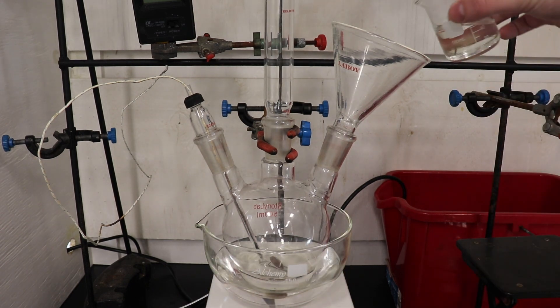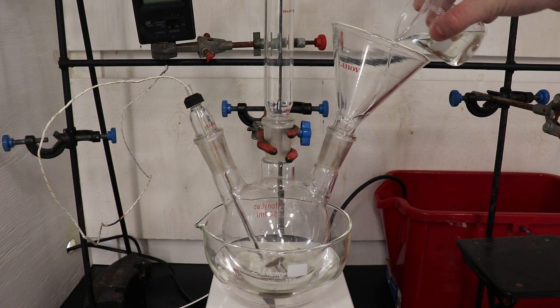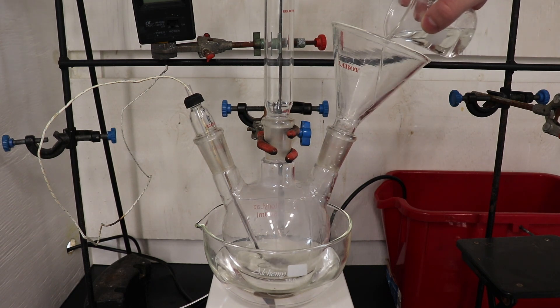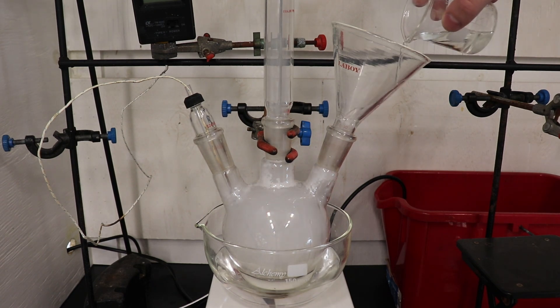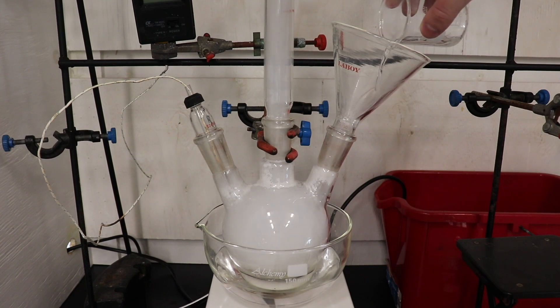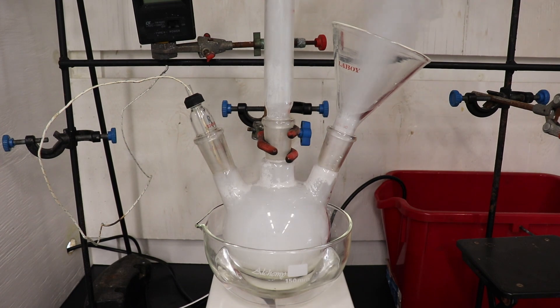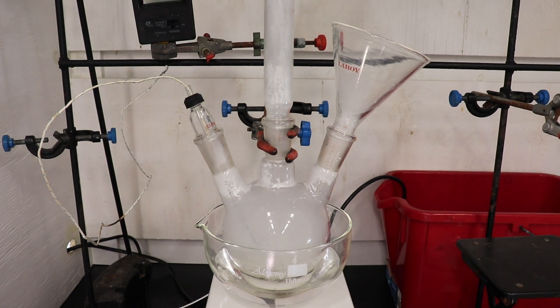Hydrochloric acid was then added until the mixture was strongly acidic, which took about 50-60ml of 31% HCl. The addition of the acid was very strongly exothermic, generating white clouds of acidic vapor and changing the color of the mixture to a pale yellow.